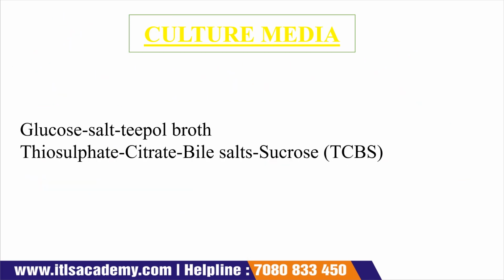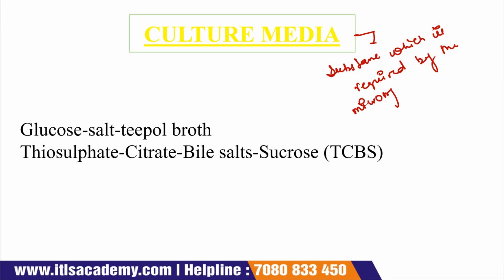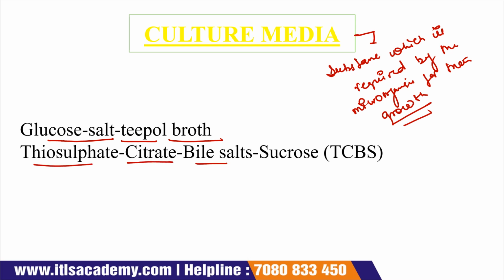Now come to the next slide, that is the culture media. We all know that culture media is a substance required by the microorganism for their growth. Here two types of culture media are required. One is glucose salt tipol broth, and the other is TCBS, that is thiosulfate citrate bile salt sucrose. First we are going to see the composition of the glucose salt tipol broth.